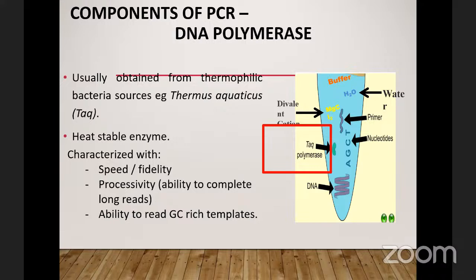So the thermocycler works on the principle of increasing temperature, hold, decrease, increase, hold, depending on what the program is set to be. And usually, you are going to be having temperature as high as 95 degrees Celsius. And then it will bring it down to 55 degrees Celsius, hold for some minutes, raise it to maybe 62 degrees Celsius, hold for some minutes, and all of that. You are going to be having changes in temperature within the thermocycler, right?